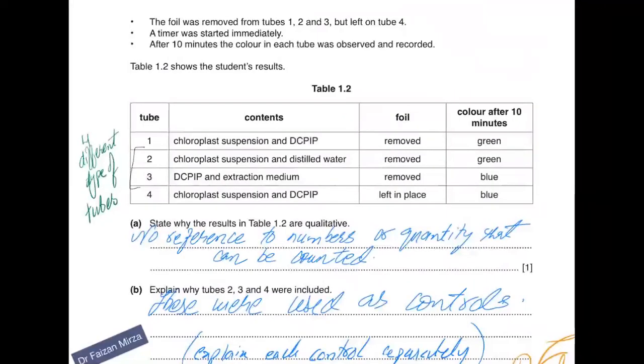The foil was removed from tubes 1, 2, and 3, but left on tube 4, which means tube 4 is telling you what happens in the absence of light energy. A timer will start immediately, and after 10 minutes the color of each tube was observed and recorded. Table 1.2 shows the results of the student.